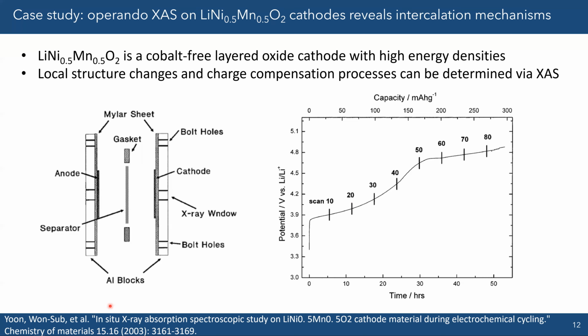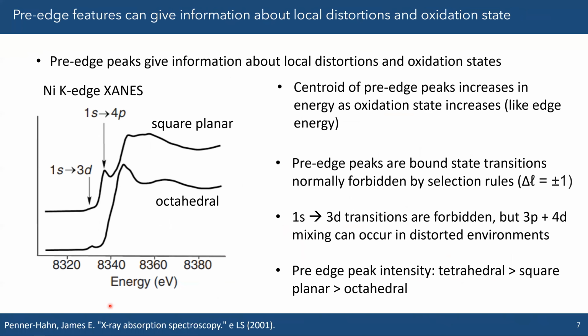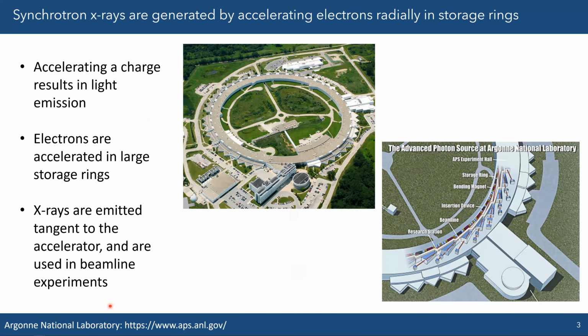Yeah, that's a great question. So remember that XAS is a synchrotron technique. So it's not as simple as XRD or XPS, where we can just do it in the lab. You'll need to apply for time on these synchrotron facilities, and the way you do so is by submitting a proposal to these facilities.